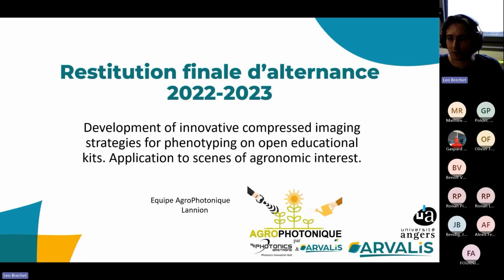So my work was mainly about driving a data measurement campaign, sort the data and save them, and also, of course, improve the GUI, so the graphical user interface of the ONE-PIX, so that it's easier and more accessible.